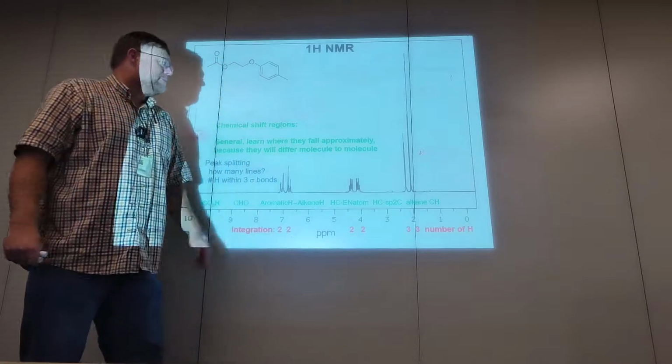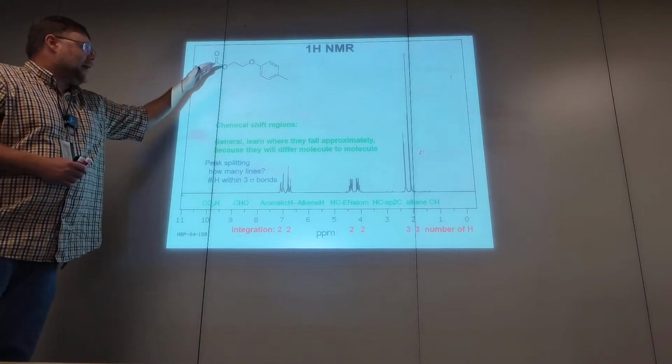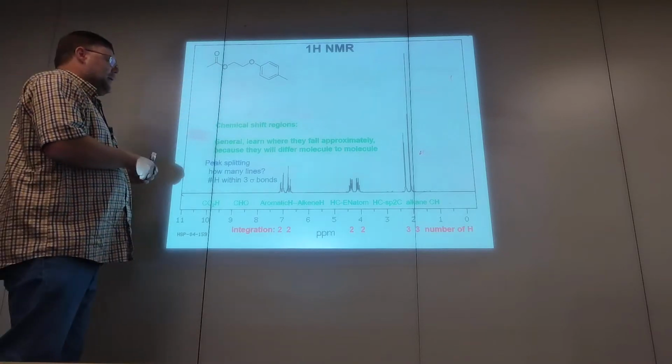Okay, but before we do this one, I asked you at the end of the last video to assign every peak. I guess something I need to say here.